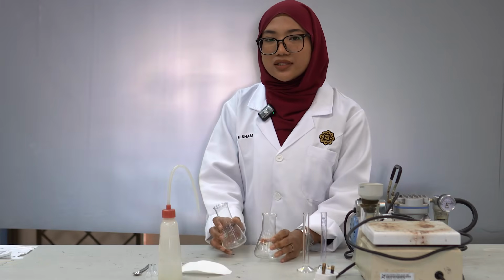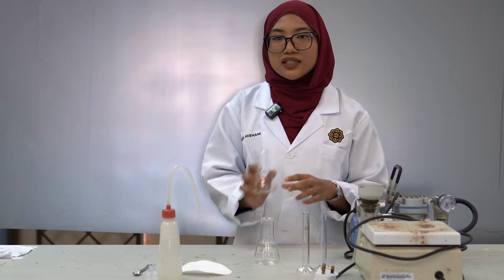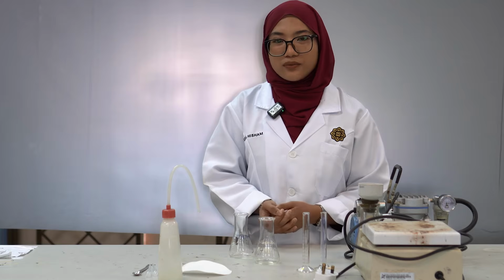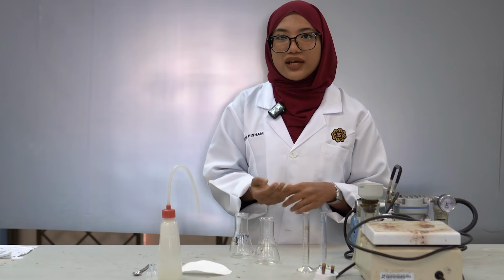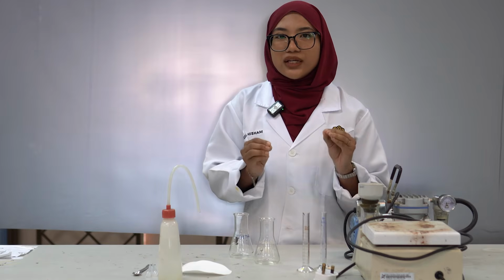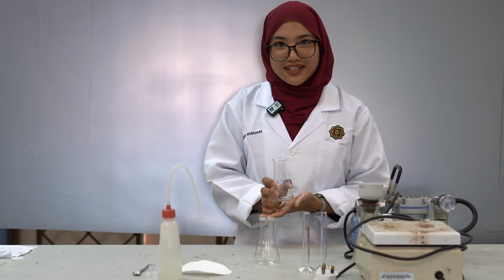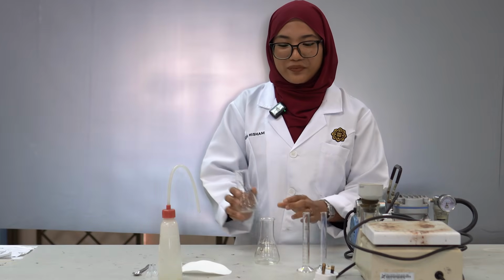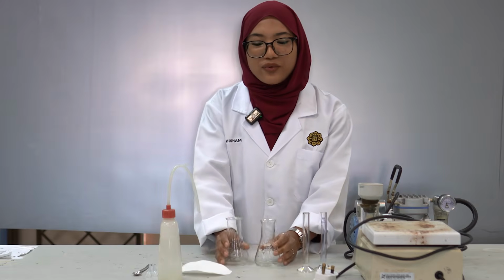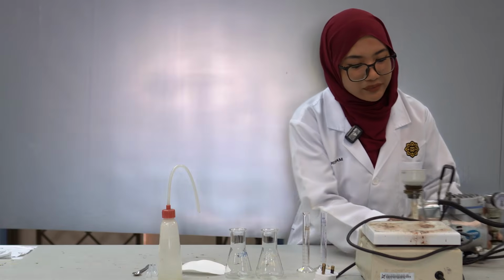Unlike the single solvent which contains hexane only, since we cooled it to room temperature, the crystal formed is more beautiful and the molecules are more clear. Okay, so we are done with this vacuum filter. Oh, and make sure to turn off the switch.